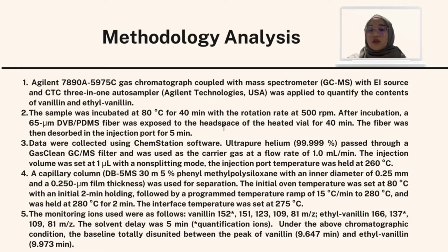The solvent delay was 5 minutes, and the chromatogram of the sample and the mass spectra of vanillin and ethyl vanillin are shown. Under the above chromatographic conditions, the baseline was totally separated between the peak of vanillin at 9.647 minutes and the ethyl vanillin at 9.973 minutes.